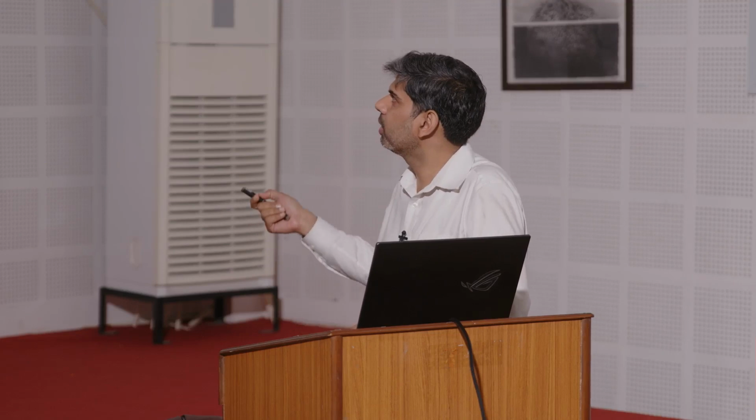So, before we go, let me just point out the main difference between electroosmotic flow and the typical flow that we have by pumping. Consider that this is a channel and you apply a pressure gradient, high pressure over here and low pressure over here, for example, when we use pumps to flow. Here I am showing an experiment where a fluorescent band of dye was initially introduced at the channel inlet, and now you have applied a pressure drop, and now you have pressure driven flow.